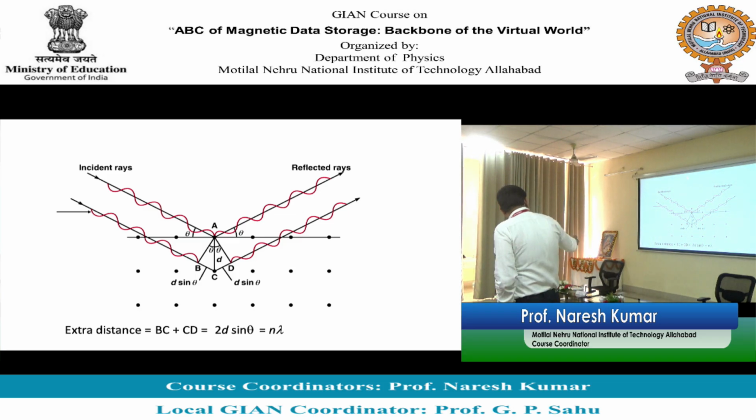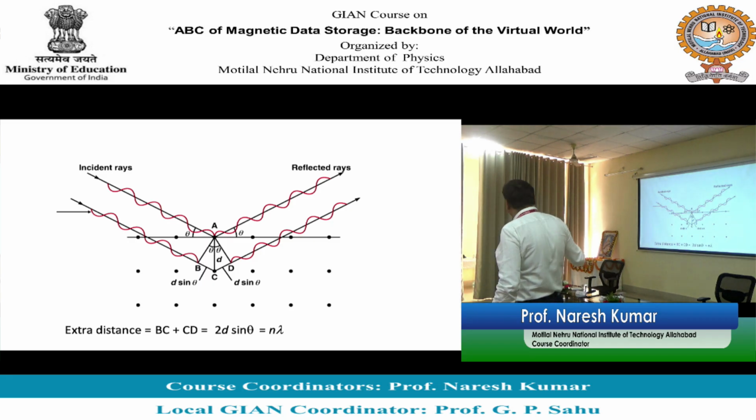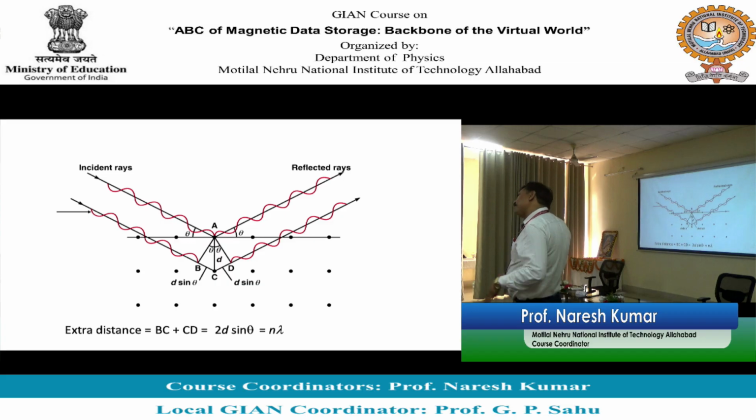नहीं, वो रिफ्रैक्शन का केस है, here it is reflection. मैंने लिखा है यहाँ पर डिलिबरेटली, this is written as reflected, diffracted नहीं लिखा है. It is written as reflected ray, angle of incidence same as angle of reflection, incident ray, reflected ray and normal they are in same plane, so for me it is a reflection. अरे हम इतना क्यों आगे जाना चाहते हैं, अभी तो मैंने रिफ्लेक्शन ही पढ़ा है.